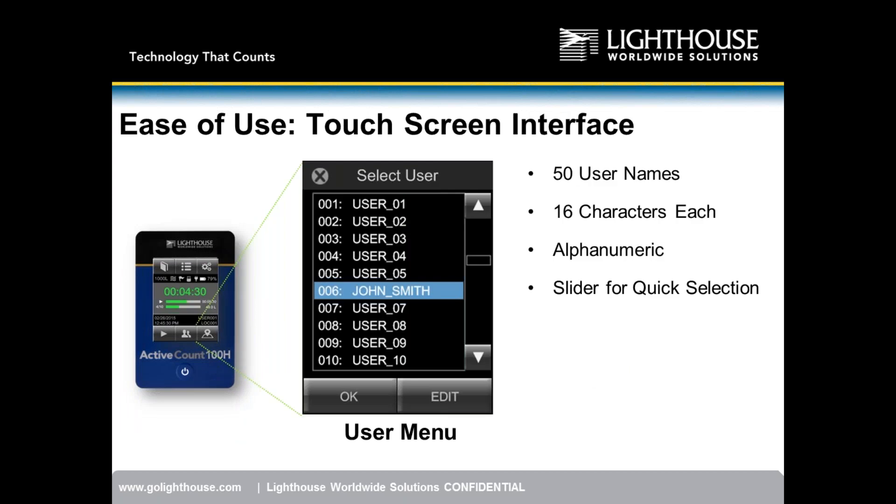The Active Count 100H supports up to 50 unique user names, visible under the user section — the silhouette of two people icon. Each name can be up to 16 characters long, using a combination of letters and specific signs. A slider allows quick access to all users. Once entered, names stay in the system and don't need to be re-entered.